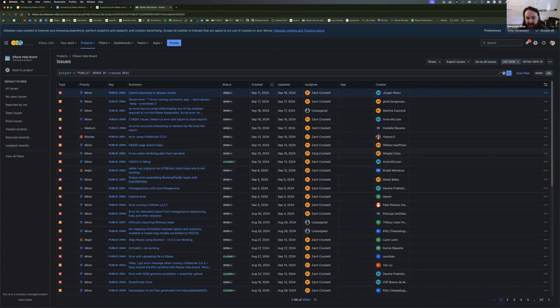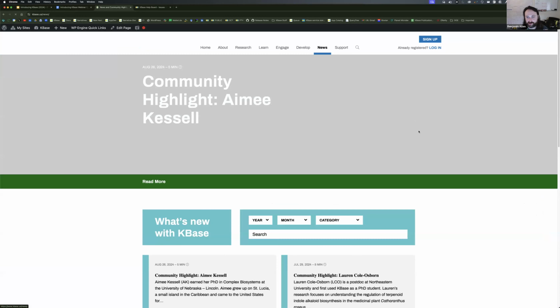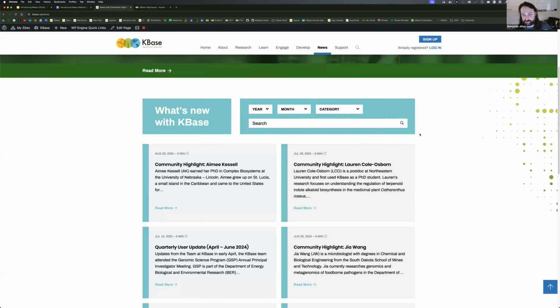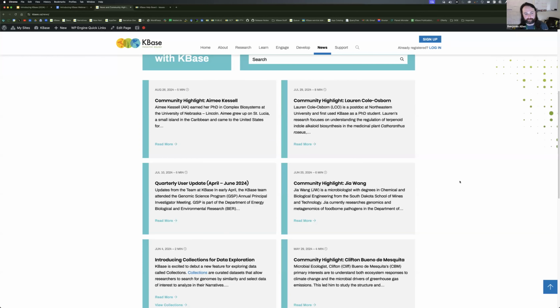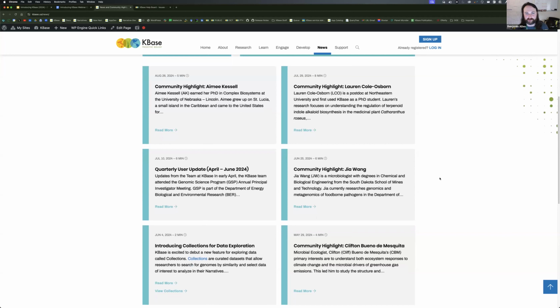And as you can see, my colleague Zach Crockett helps lead our help board effort. So if you have an issue, Zach will be very quick in responding and helping you out. Other things to check out are our news section. Whenever we have new features, or examples of our users who are having success with the platform, we try to put these up on our news page so that you all can see what we're doing there.